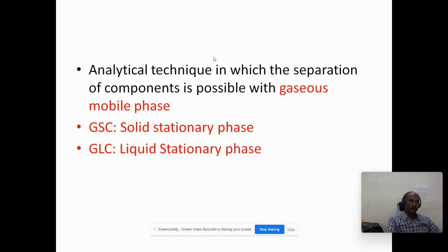First of all, why do we have to give importance to gas chromatography? There are so many analytical techniques. Among all the analytical techniques, one of the important analytical tools is gas chromatography.